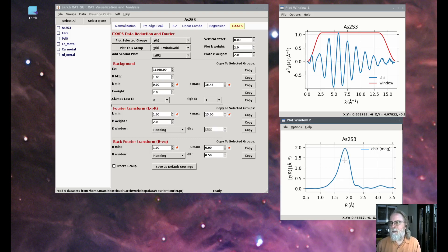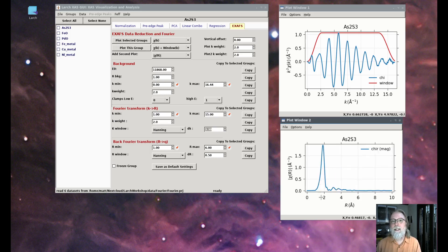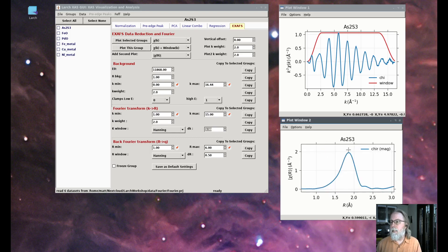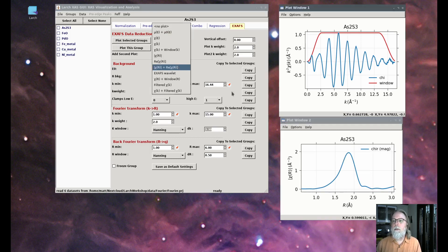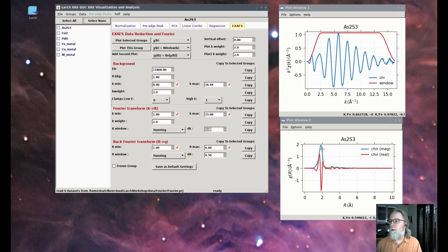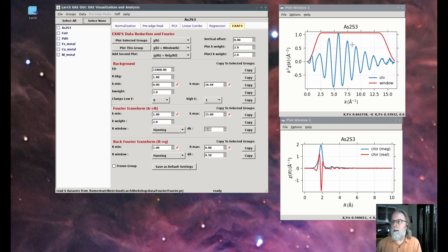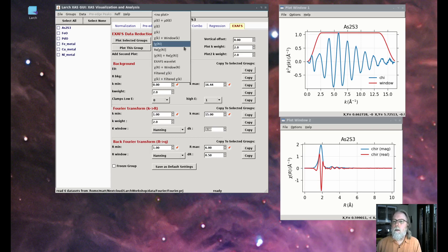The peak is not where the distance is — it's correct data, just not directly the bond distance. We also need to think carefully about the data in terms of both the real and imaginary components and the magnitude. Since the original data is strictly real, when you Fourier transform it, the real and imaginary components are not meaningfully independent — we asserted the imaginary part of the measurement is zero, which means the real and imaginary parts of the Fourier transform are not independent.